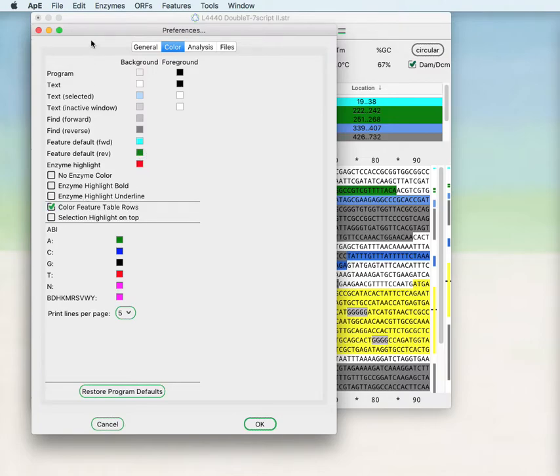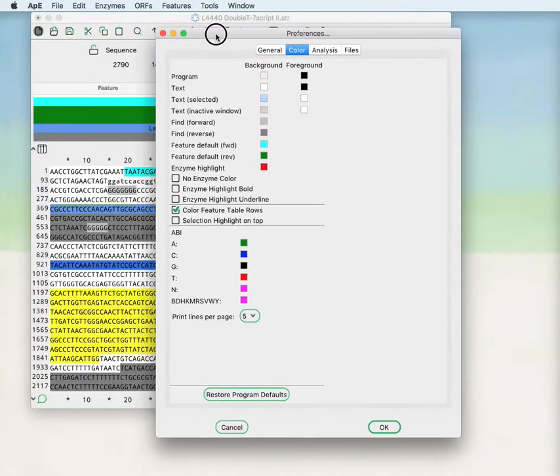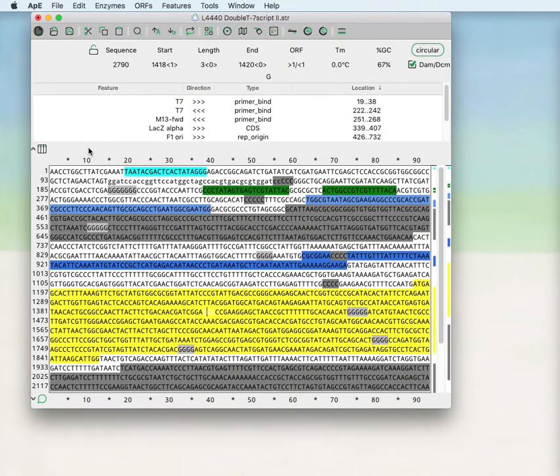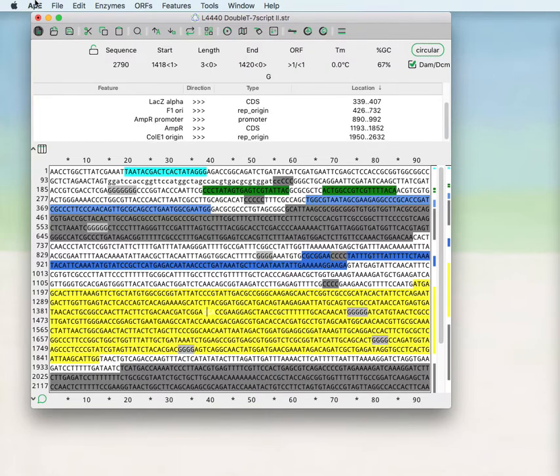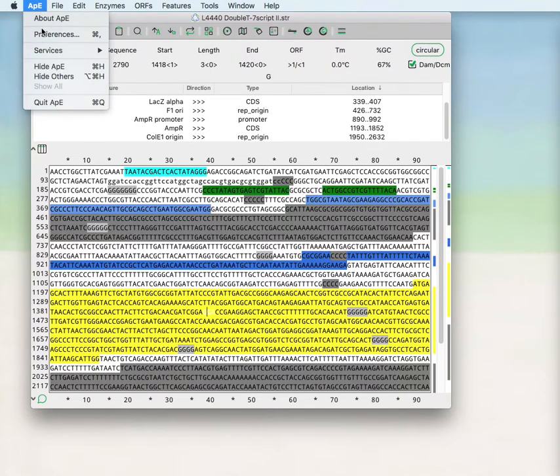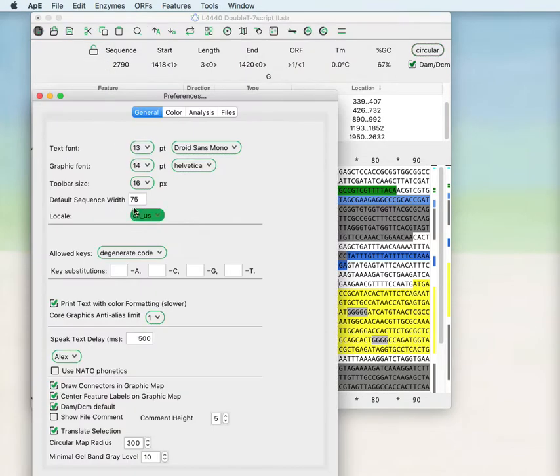You can change whether the feature table rows are highlighting the colors or not. Some people prefer the feature colors to be highlighted here. Some people prefer it all white.